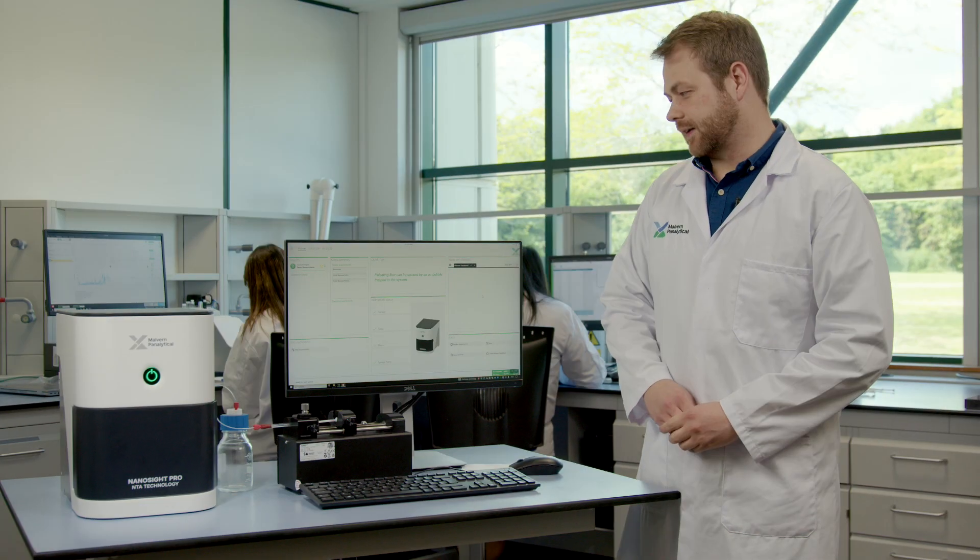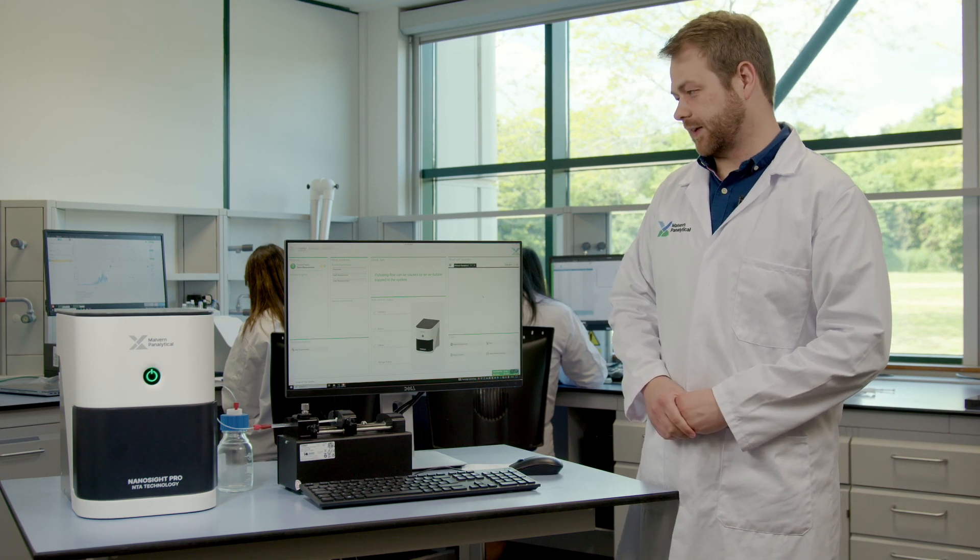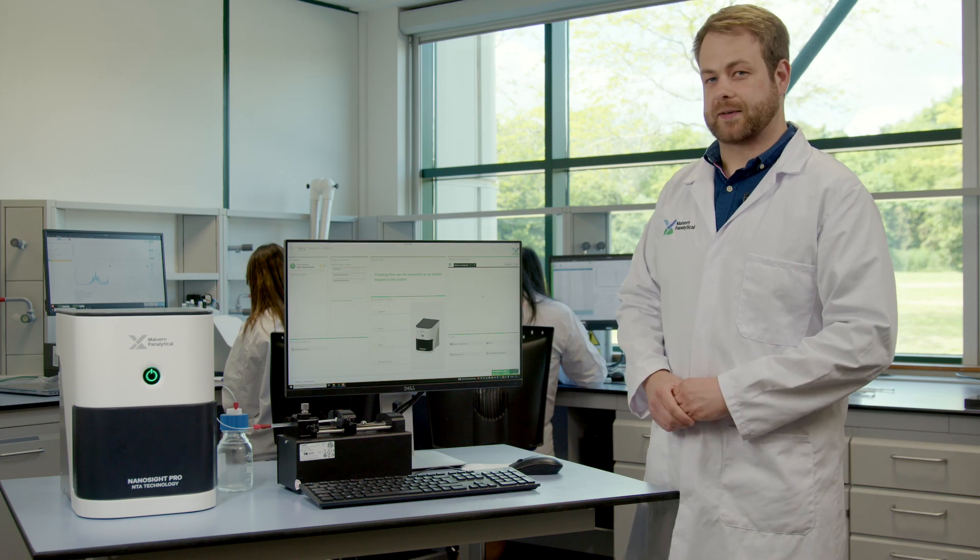We start off on the home page so here we can look at things such as the instrument status and check things are connected properly. We can look at our favorite projects and experiments and also we can get news and updates from Malvern Panalytical.